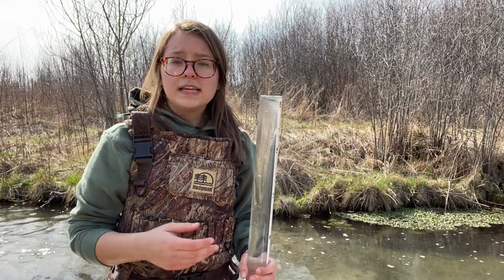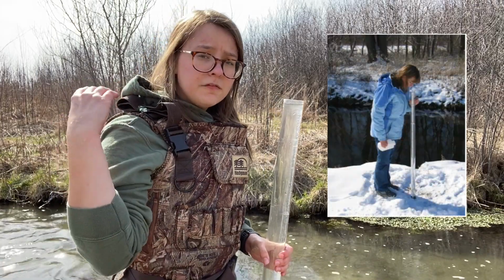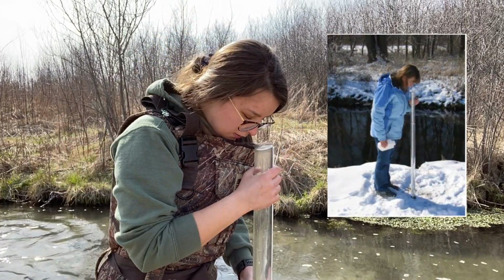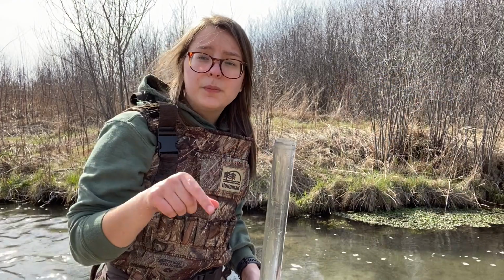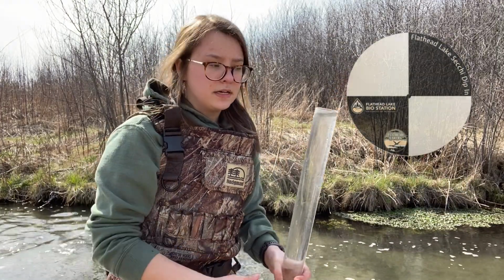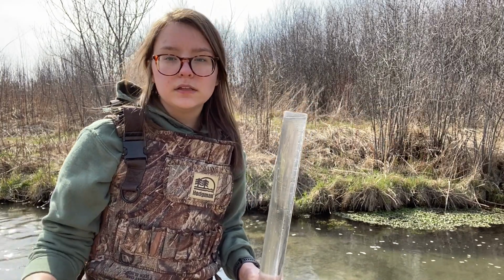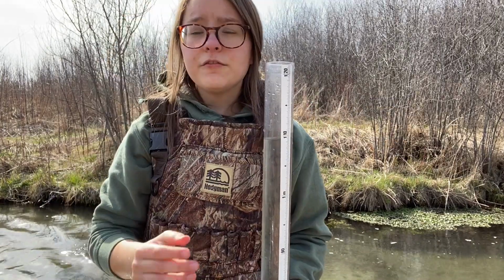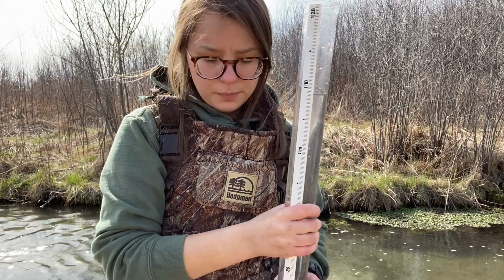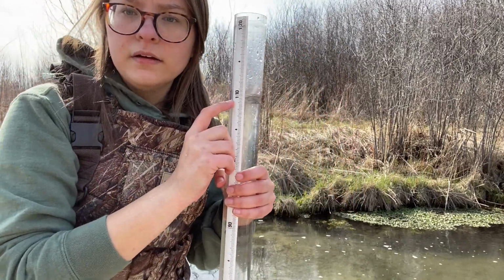Now, once I have my tube filled up, I will stand up on the bank with the sun facing my back and look down at the bottom to see if I can see the black and white disc at the bottom, known as a Secchi disc. If I can't see the black and white disc, that's okay. That just means it's a little cloudy in the stream. After I've looked at the top of the tube and I let out the amount of water I needed to, I will go ahead and place this back up on the bank and look for the water line.